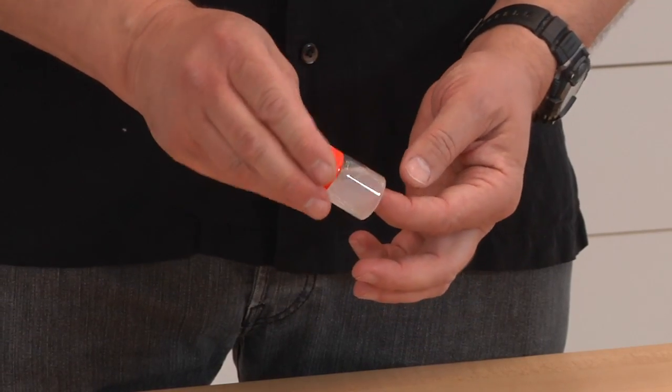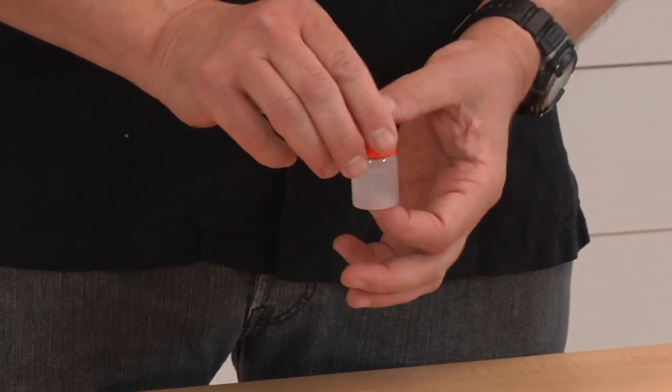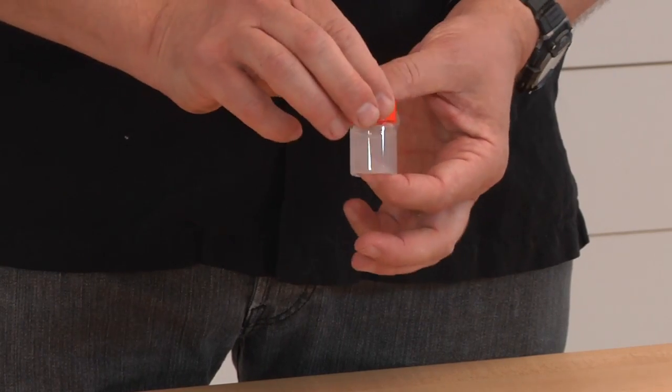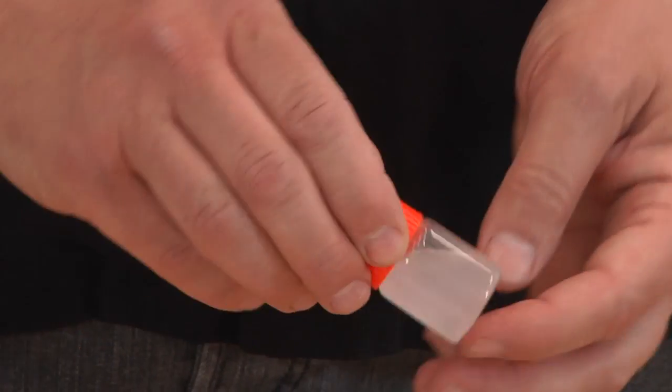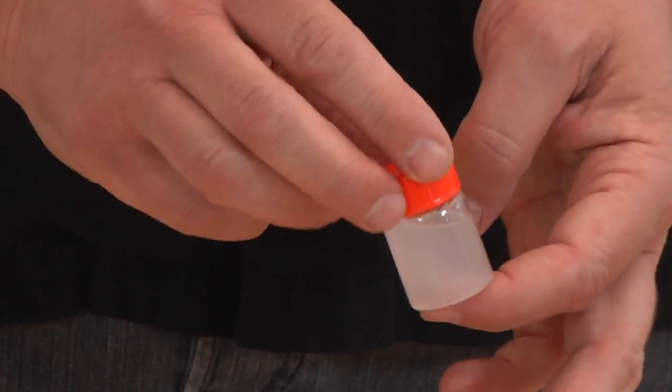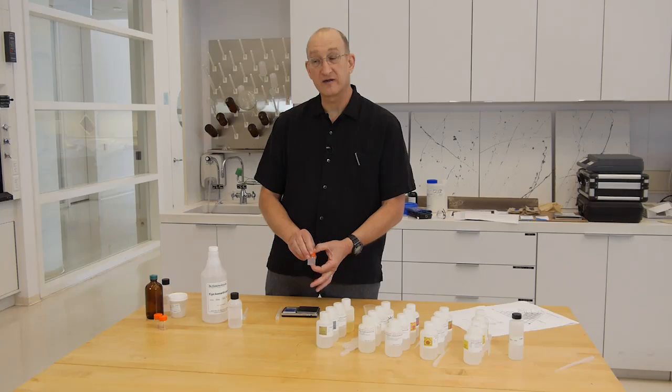Ideally, it should be clear. It's very temperature dependent, so sometimes it'll be a little milky, depending on the temperature we've made it at. But basically, this is a homogeneous material. You can see the viscosity is relatively low, unlike conventional emulsion.